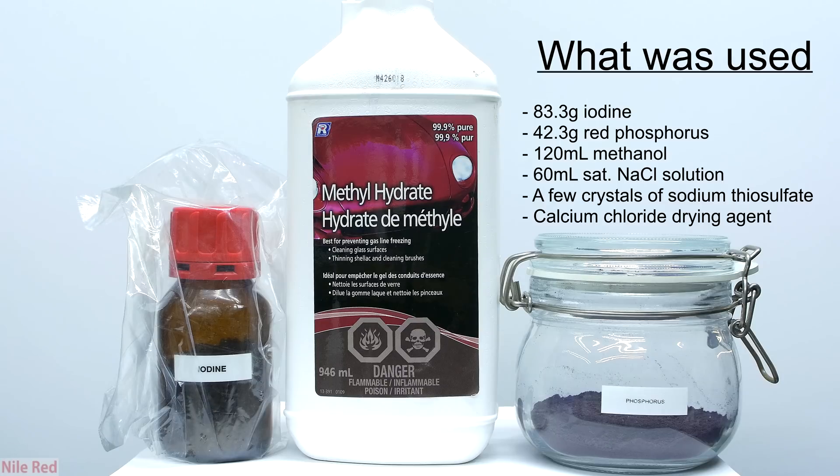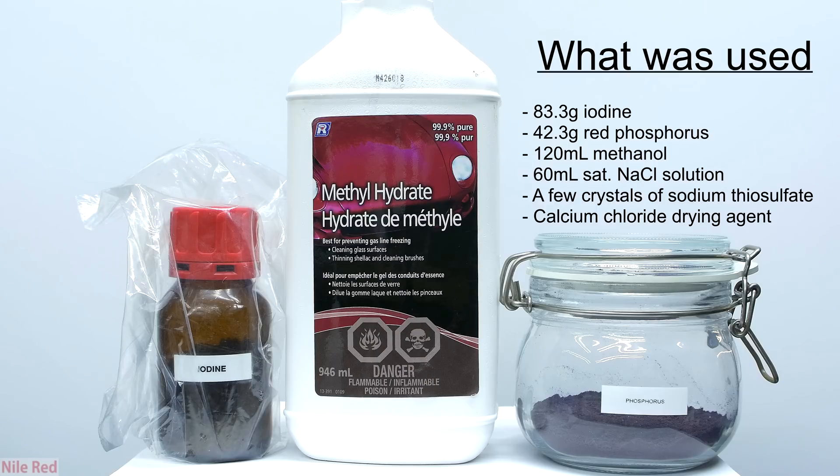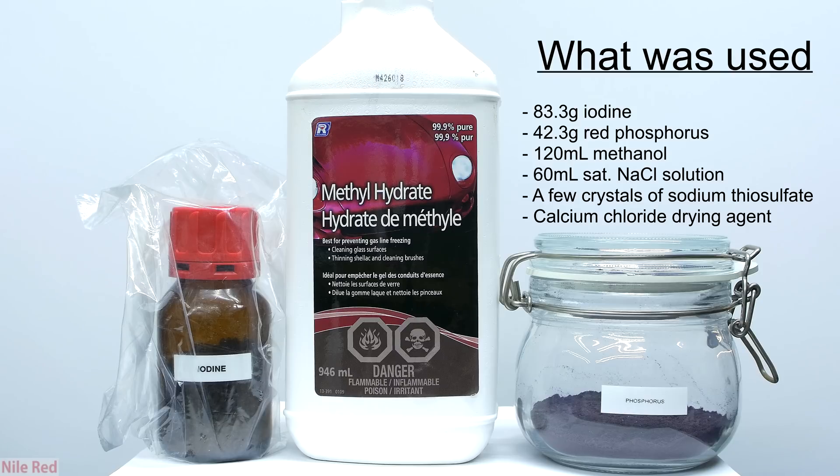We're going to be making methyl iodide the classic way from iodine, red phosphorus, and methanol. In terms of quantities, I used about 83.3 grams of iodine, 120 milliliters of methanol, and about 42.3 grams of red phosphorus.